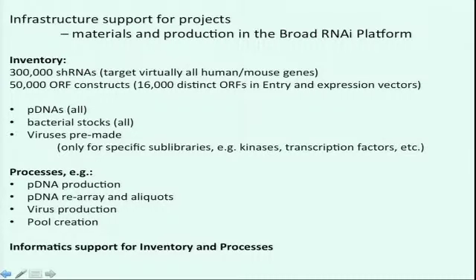Now, for such a large inventory, we've designed a couple of lab processes that will help you utilize the library more efficiently, and we've just streamlined these processes. I'm just going to talk a little bit about our high-throughput plasmid DNA production, our plasmid DNA rearray, and aliquots.